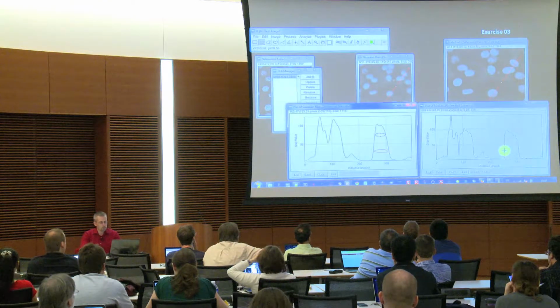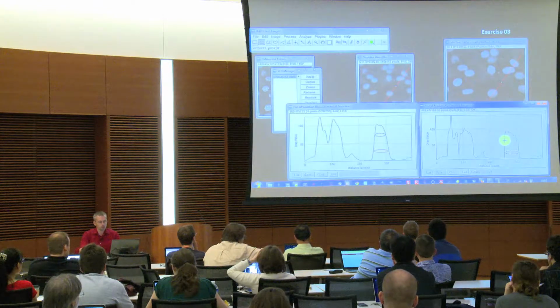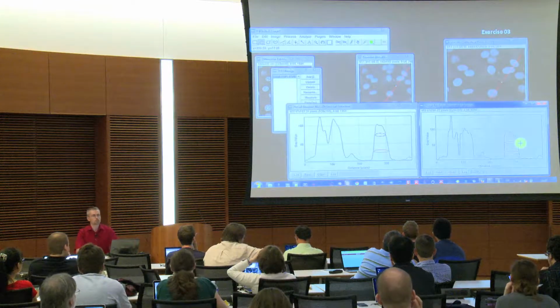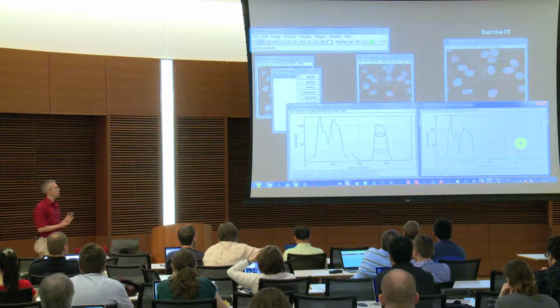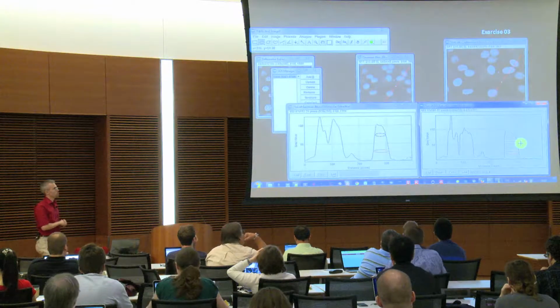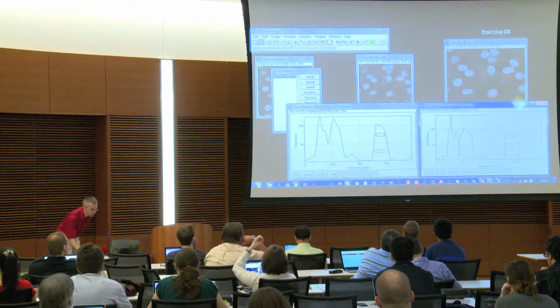So in the median filtered case, this is not as strong because if I do it here or if I do it here, you see that the final object size is very similar. That is why the median filter preserves outlines, preserves edges, and preserves sizes of objects better and is actually more suitable for those kind of purposes to extract that.